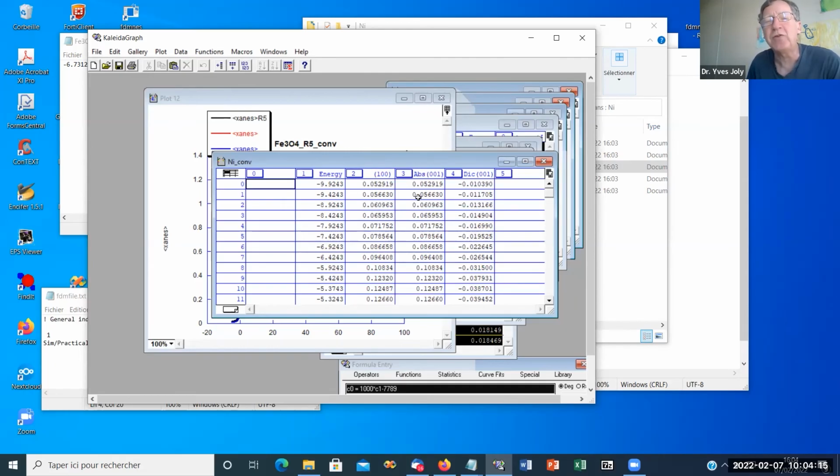And it's not useful because when you do that, the code automatically calculates left polarization, right polarization, then makes the half sum, so it gets the classical absorption along this Z direction, and then the difference between left and right, or right and left, I never remember. And so you get the dichroism XMCD around this direction. So let's plot them.